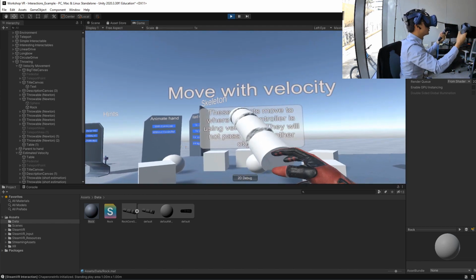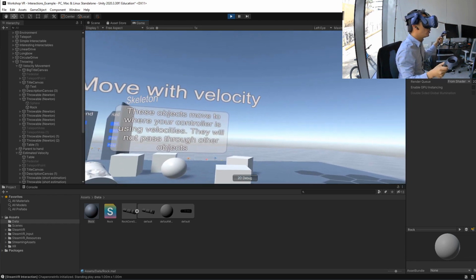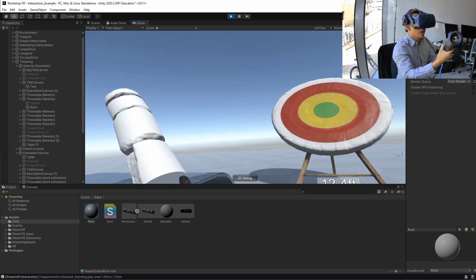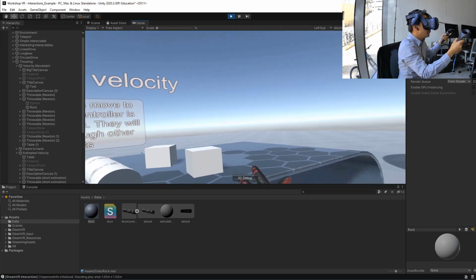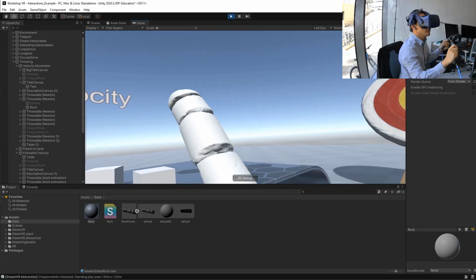And if you're telling a story, for example, you can let users get into this VR world and play around with your different rock samples. Or if you have a collaborator who cannot travel, for instance, then you can set up a virtual collaborative world where you can explore your different data sets.